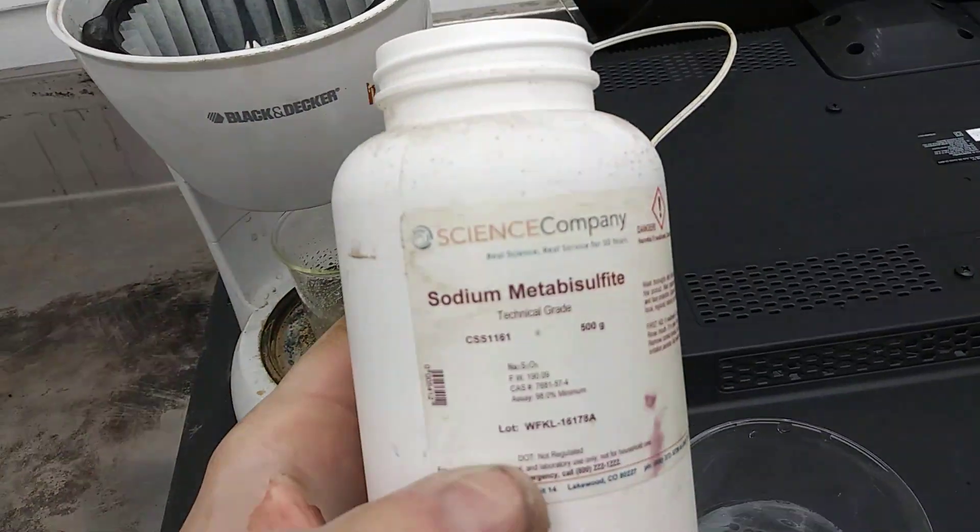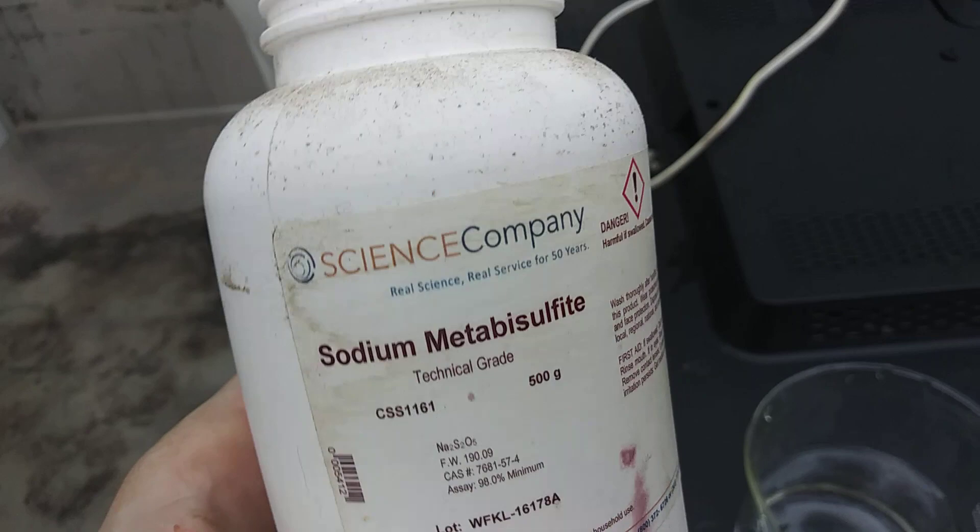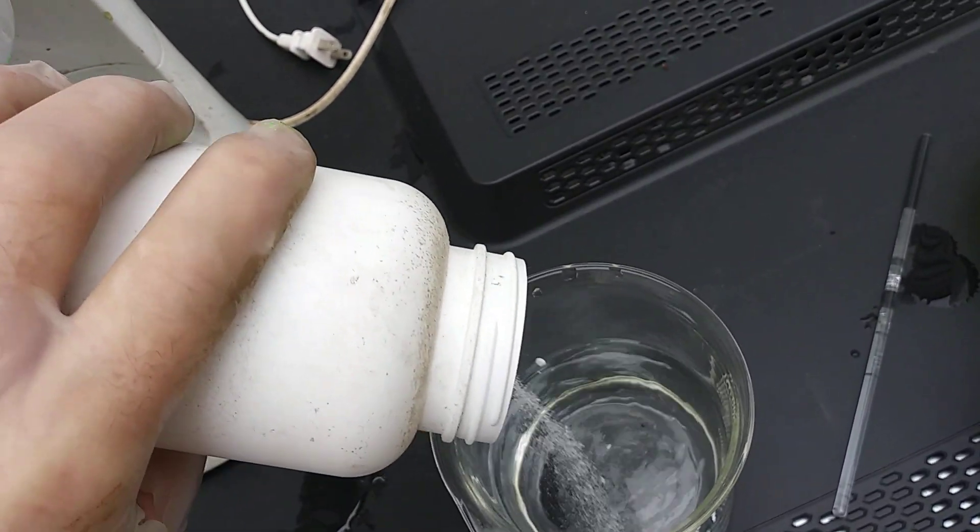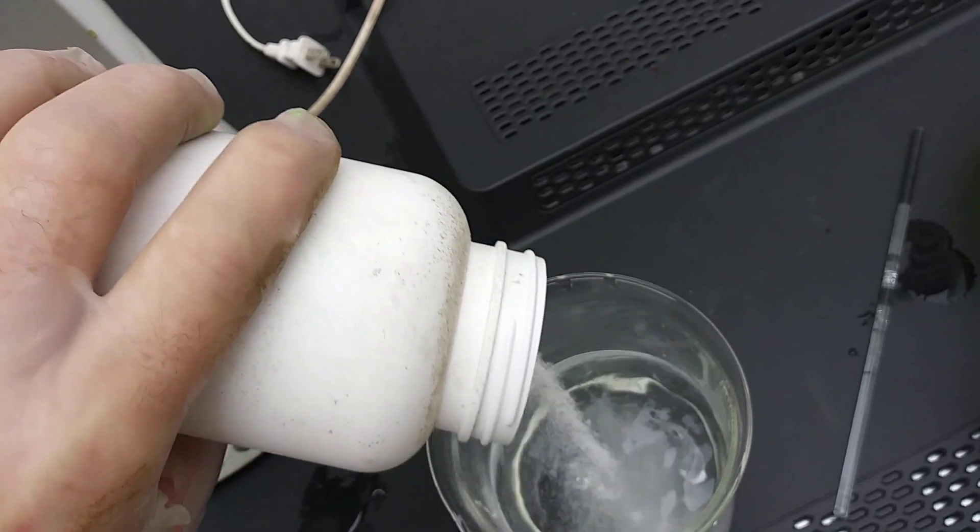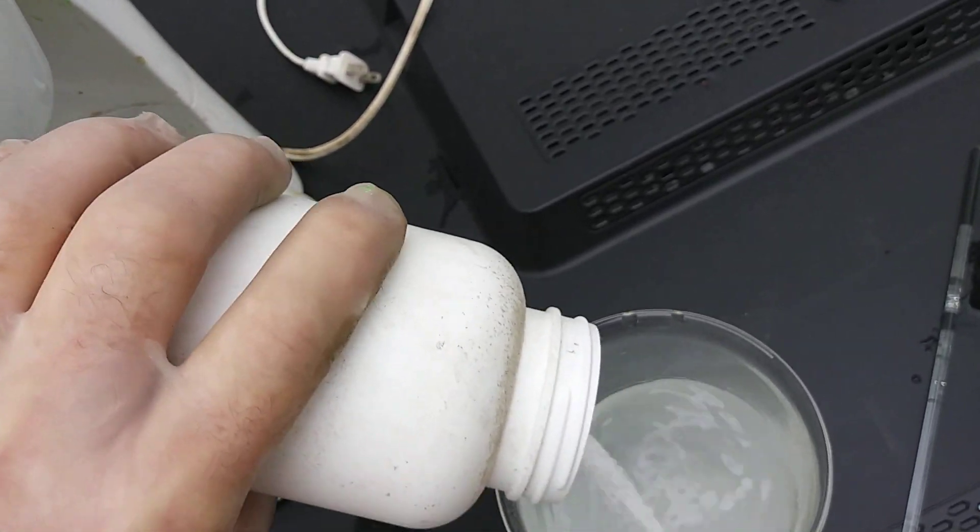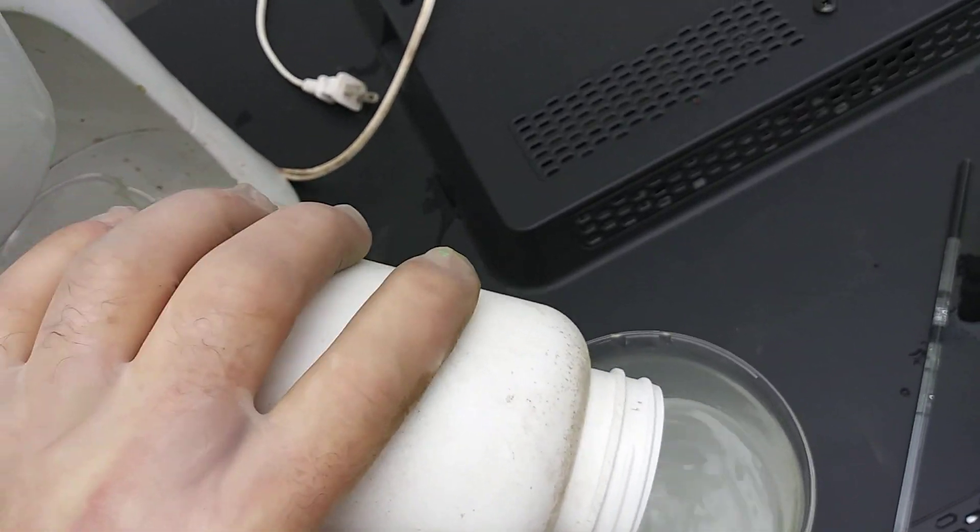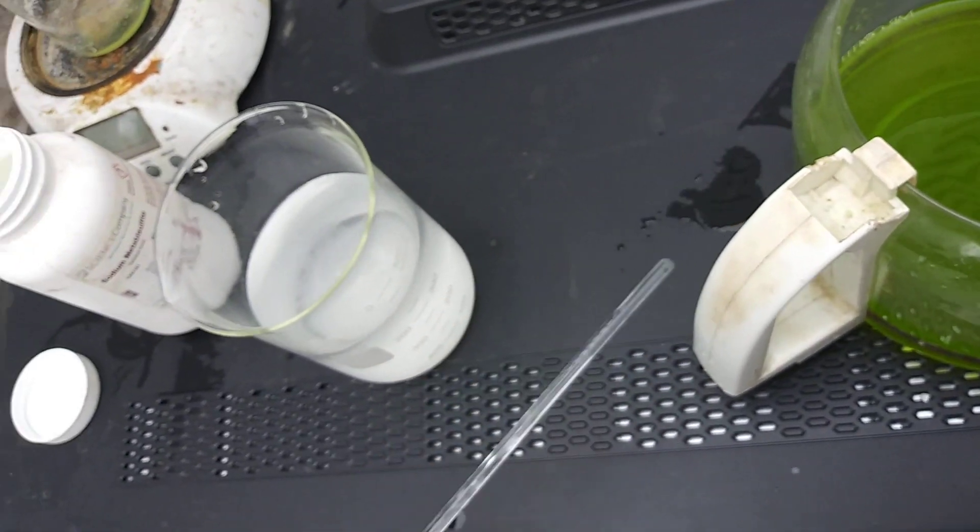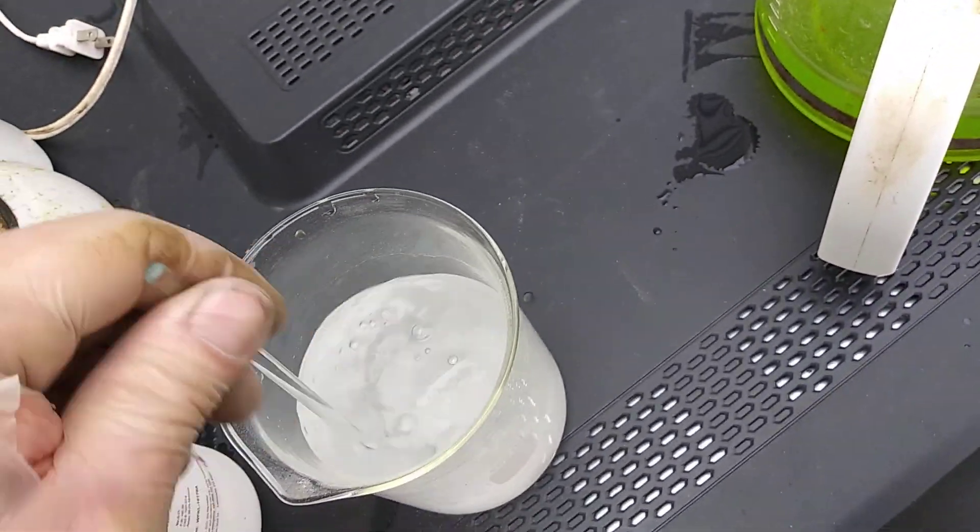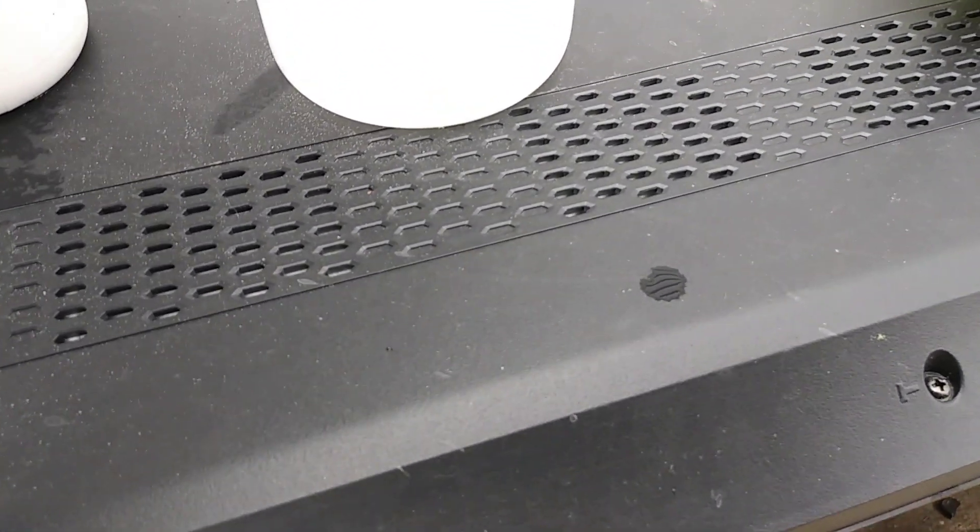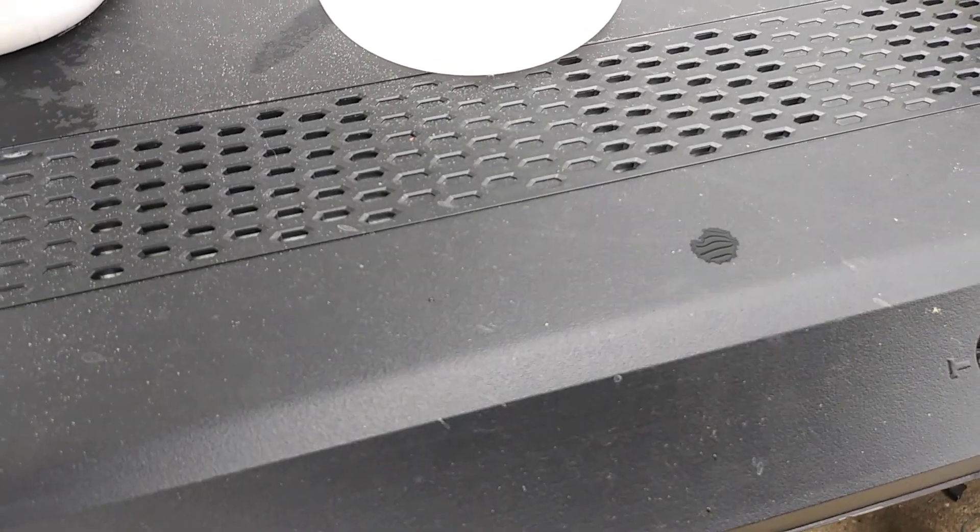So what I want to do now is take sodium metabisulfite and kind of just eyeball it. Some people say you can't put too much, so I'm just dumping it in there. I've done this quite a few times. Some people take the powder and put it right in there. I like to dissolve it in water. Takes a little bit to dissolve sometimes.